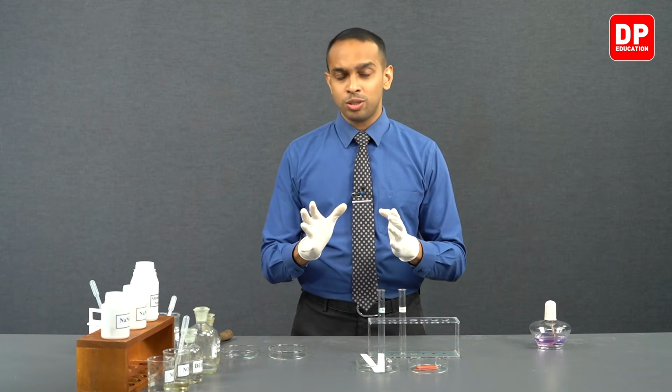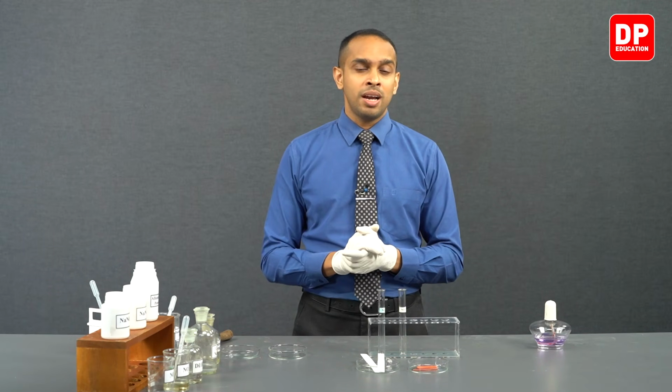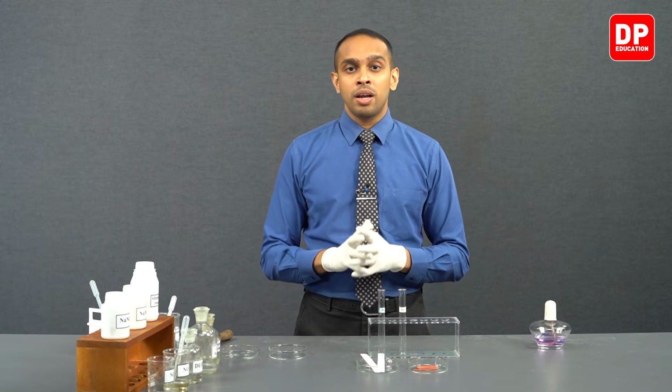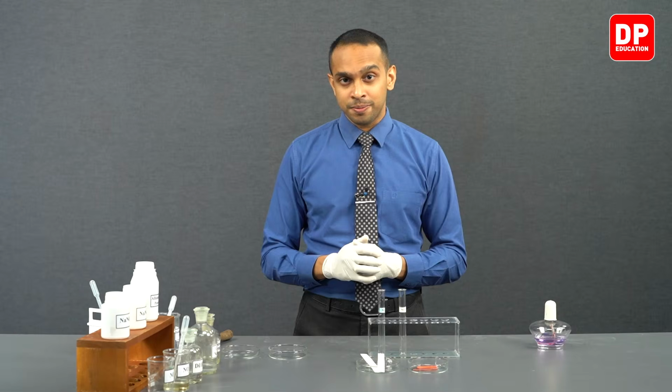Now, as you add sodium hydroxide, aluminium gets oxidized, going from 0 oxidation state to +3 oxidation state, and in the presence of excess sodium hydroxide it forms sodium aluminate.